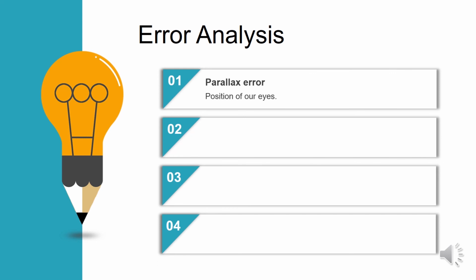Furthermore, human error might also occur when we carry out the titration. This was because we hardly determined the point of titration when the yellow solution becomes a pale color in the BOD test, and the point of titration when the green solution becomes blue-green, as it was difficult for us to differentiate these similar colors. In addition, sometimes we might miss the first sharp color change, so the endpoint of titration taken might be inaccurate.